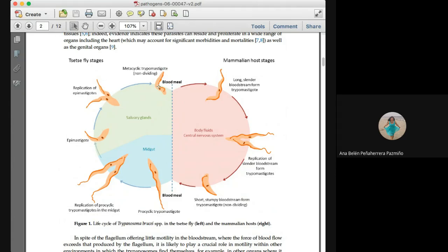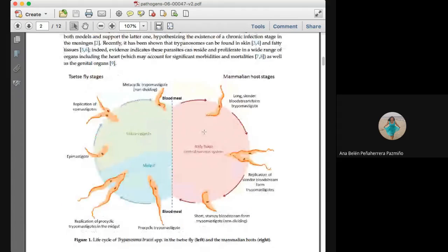It has motility, which is quite difficult to see in the normal way, meaning with the flask. That is the reason they use microfluidic devices in order to separate it, especially from blood.